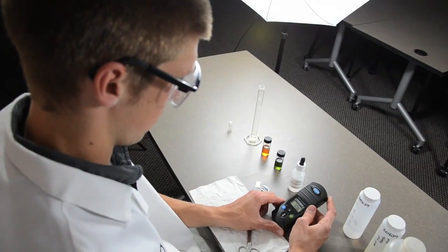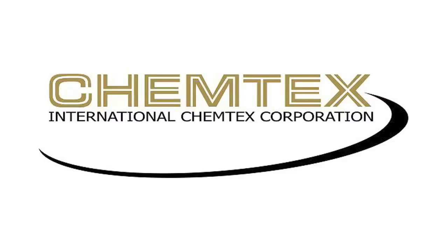This is the final result. The PC2 has already factored in the dilution done at the beginning of the test.